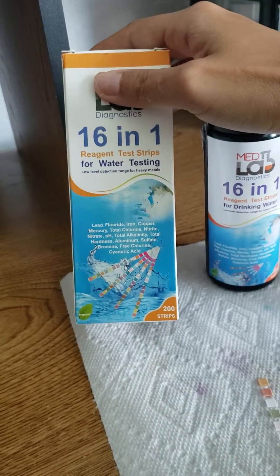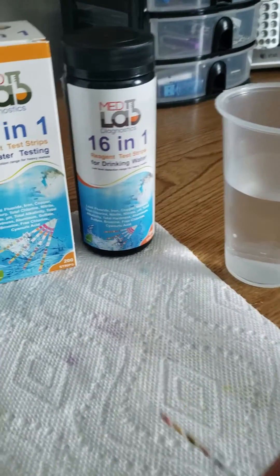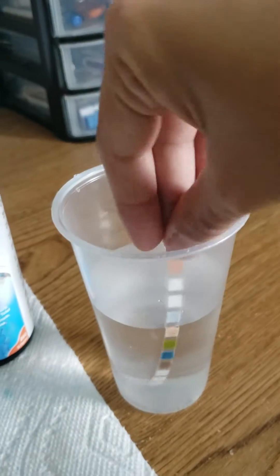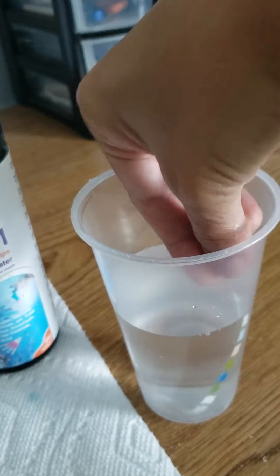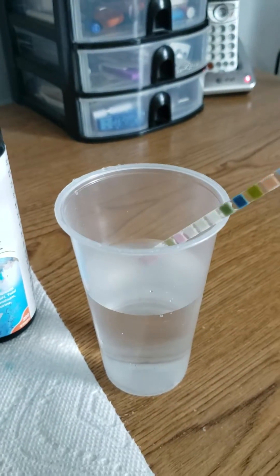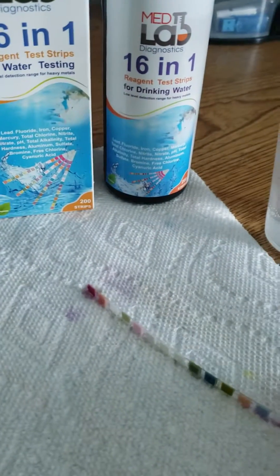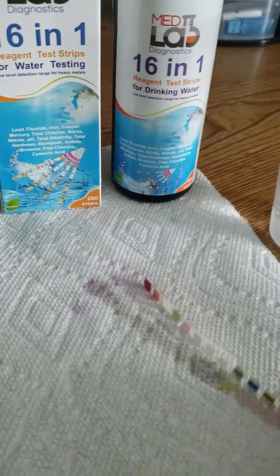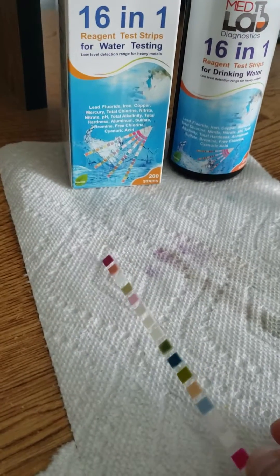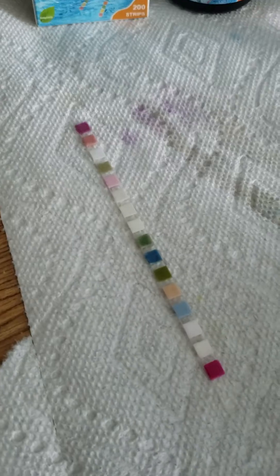We're going to go ahead and test this now. We have some test water here. You just dip your strip in the test water and make sure that you get all of your pads wet. Then you take out any excess liquid with the side of the cup, you can tap it on your paper towel, and then just lay it flat.